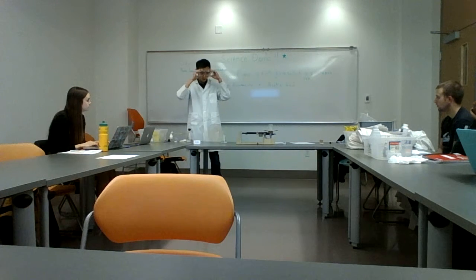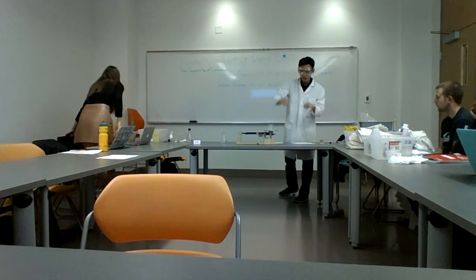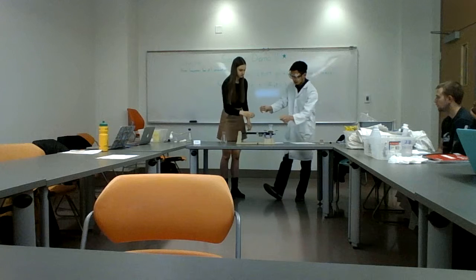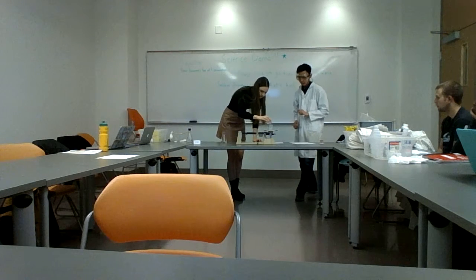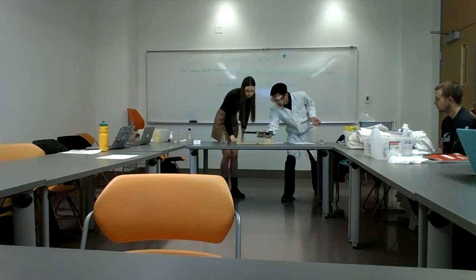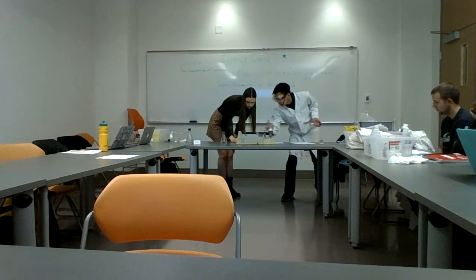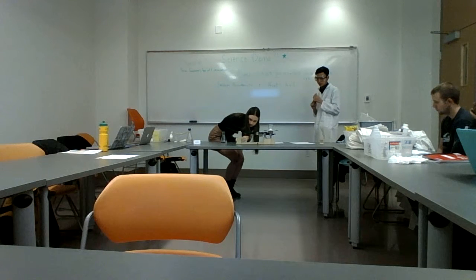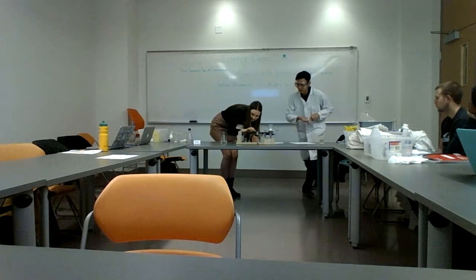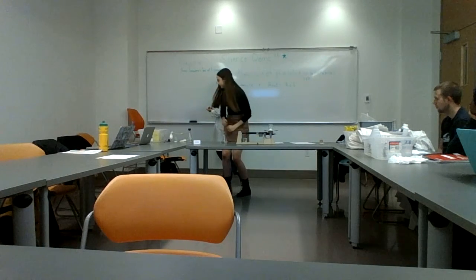And I'll wear this. So right now, Rochelle, can you please come on up and help me measure something? Right now, I have 5 grams of measured sodium bicarbonate. And just to prove it, I want you to pour this into that small beaker. You'll see the scale will move down. I'm going to move this exactly 5 places over, and we'll see whether or not this will balance properly. Is it around the 0 mark? Gotta wait for it to stop. Not yet. All right, that's a little bit okay. So let's say it's approximately 5 grams of sodium bicarbonate.